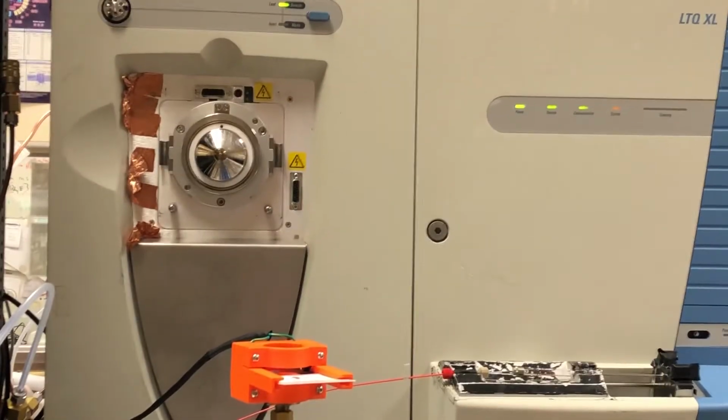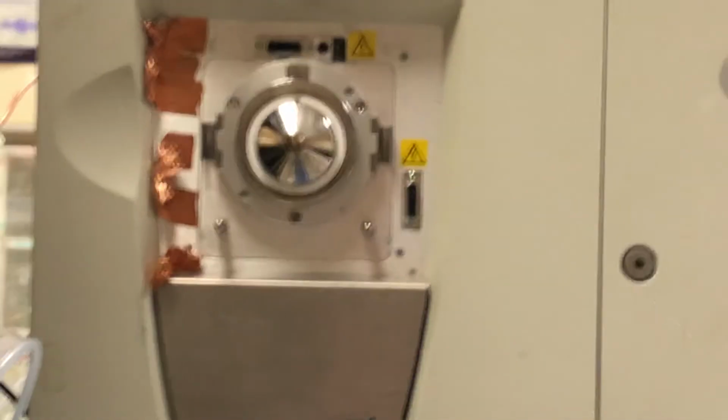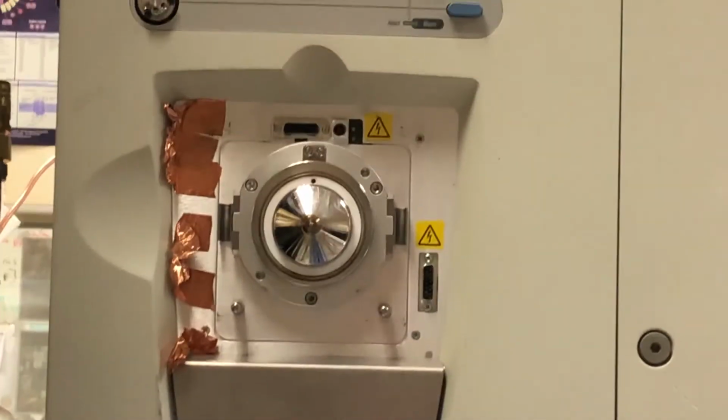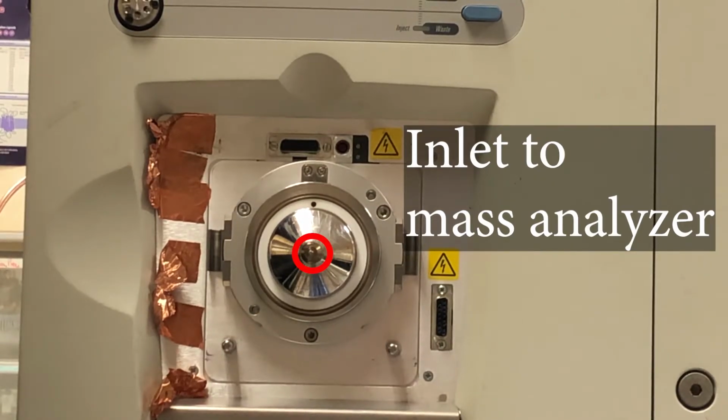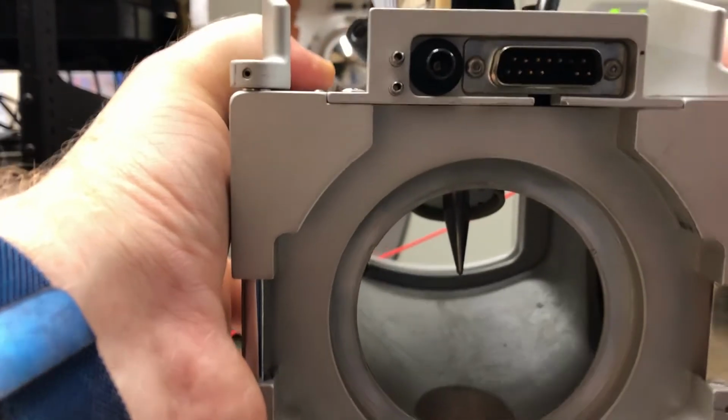Now, we're going to zoom in here. So that's the ion source that makes the ions, and there's a little hole in that capillary right there. That is the inlet. That's the inlet to the mass analyzer where the ions get pulled in.